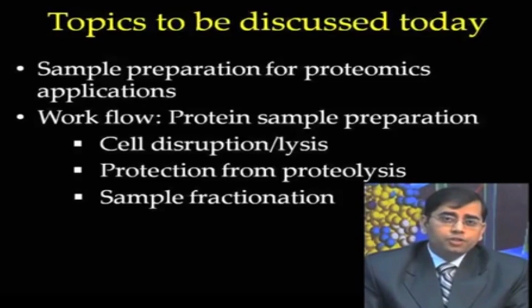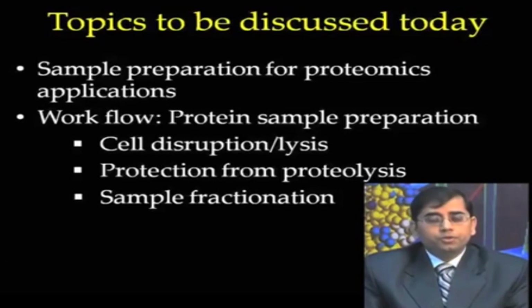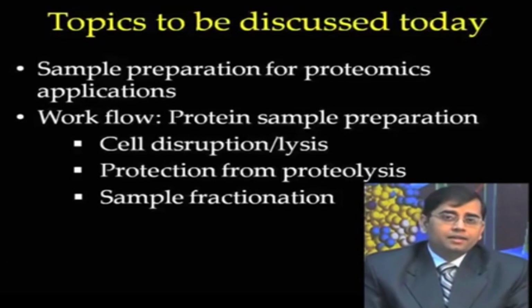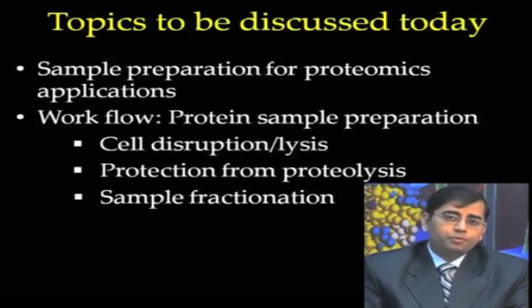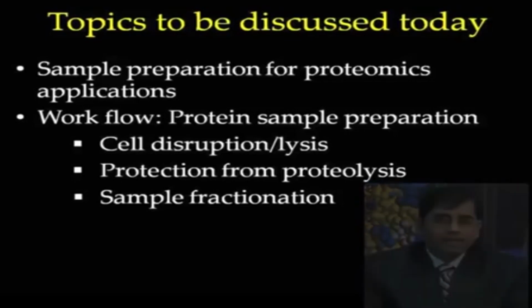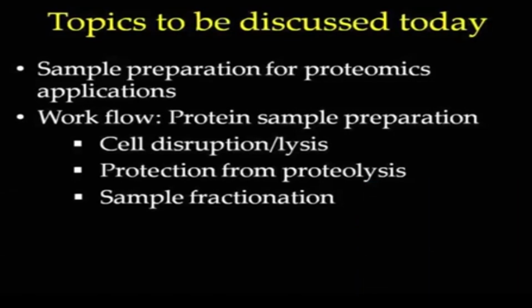Often you need to simplify the proteome, you need to ensure that the sample is simple enough to show the good proteins throughout the proteome coverage. So, to obtain a comprehensive proteome coverage, often it is important that you pre-fractionate your samples. Protein extraction and solubilization are another very essential component.